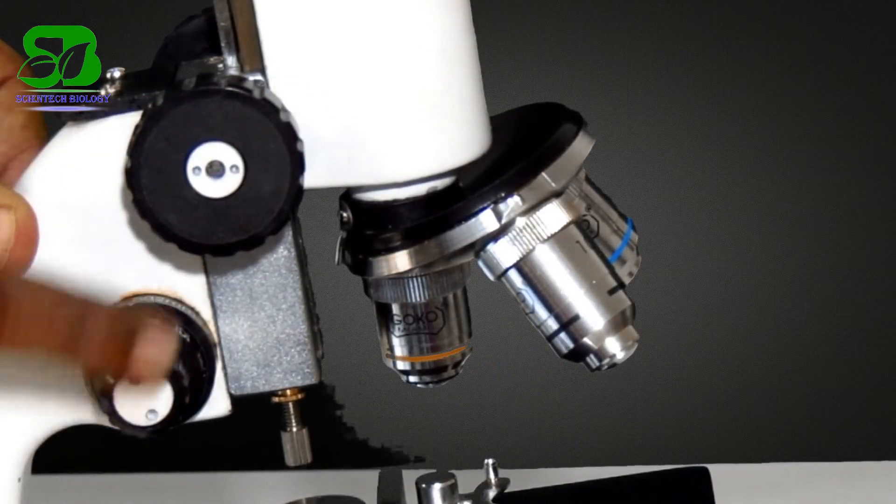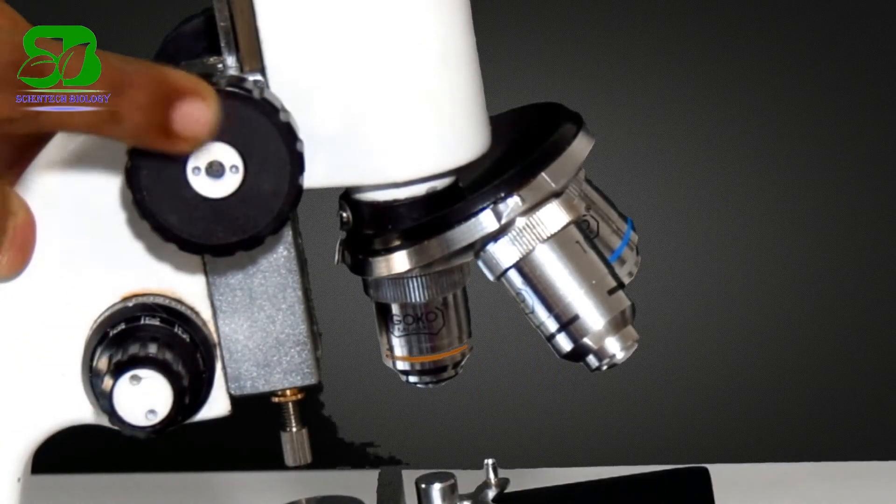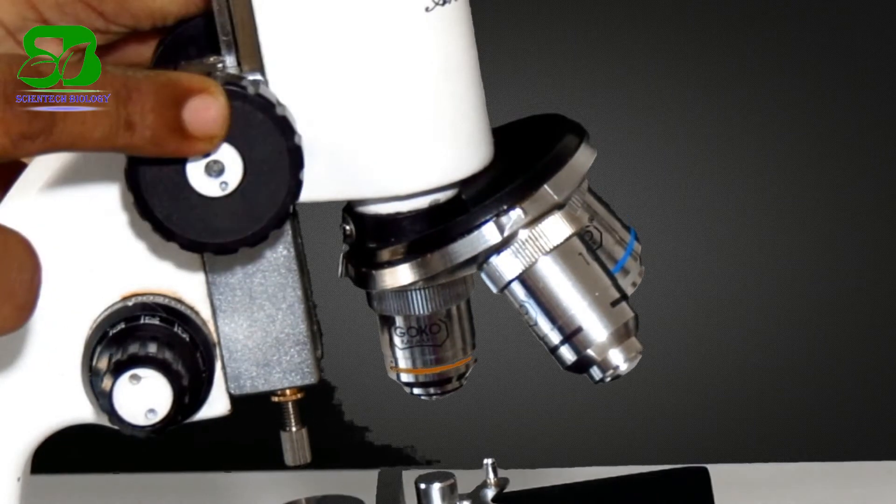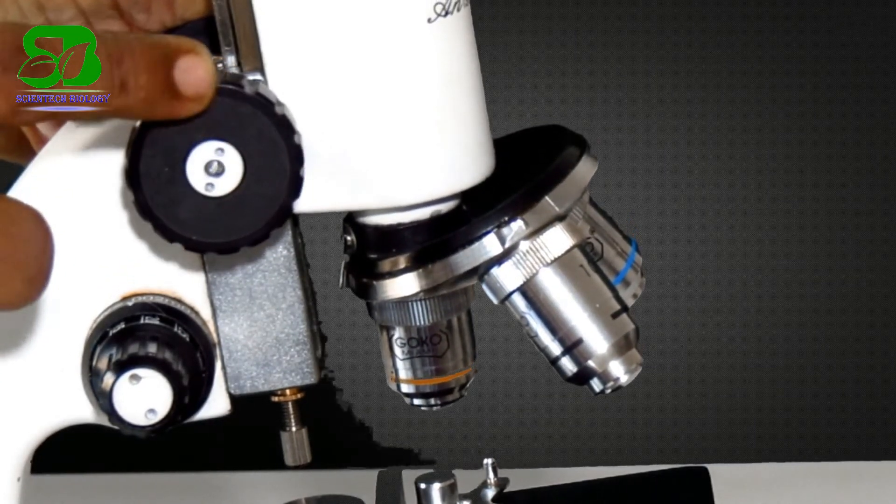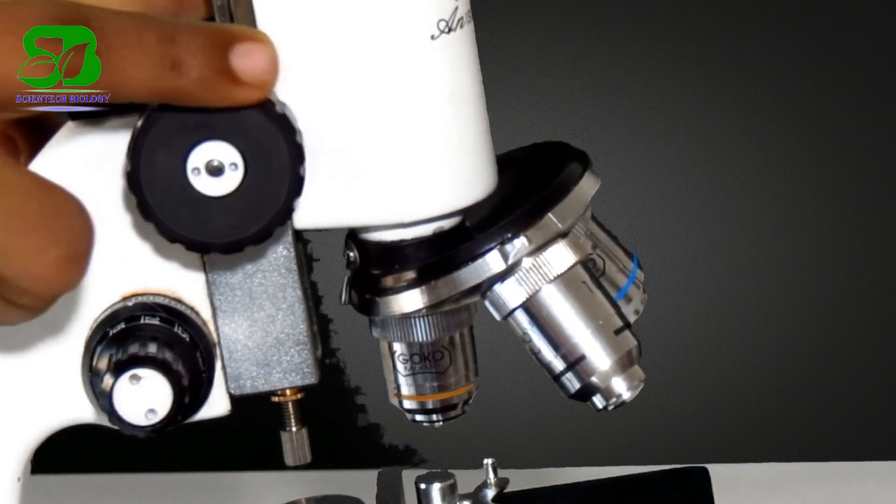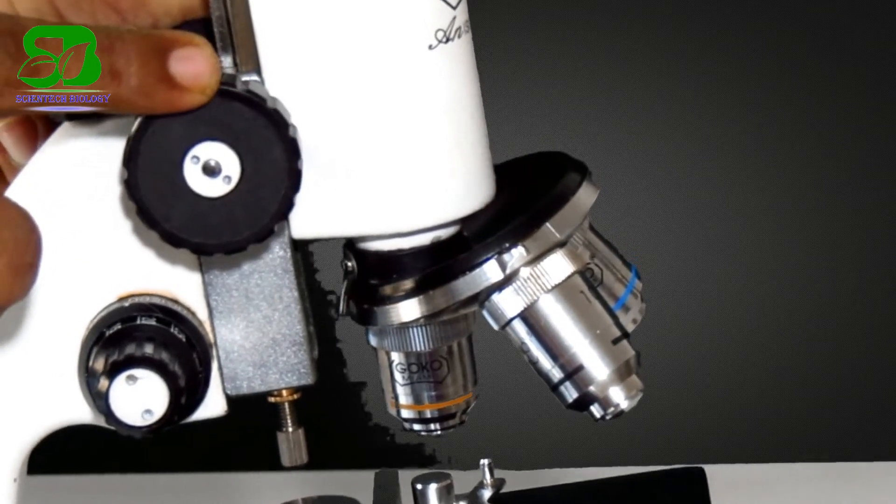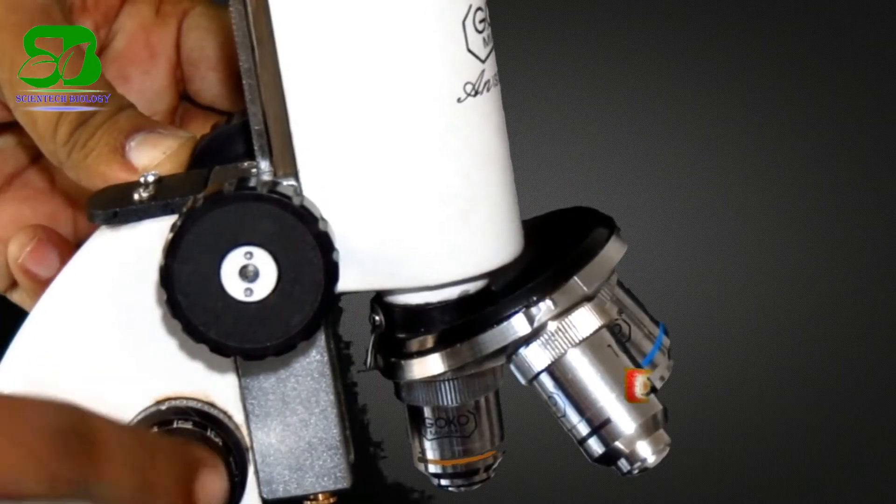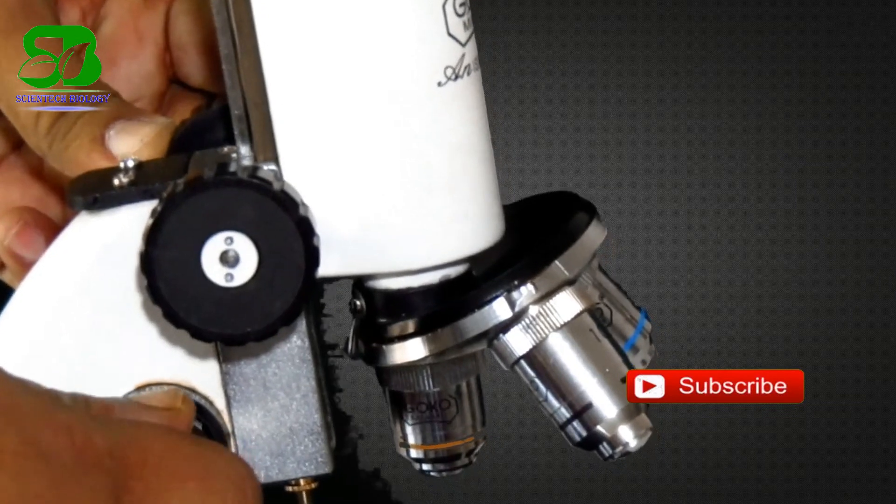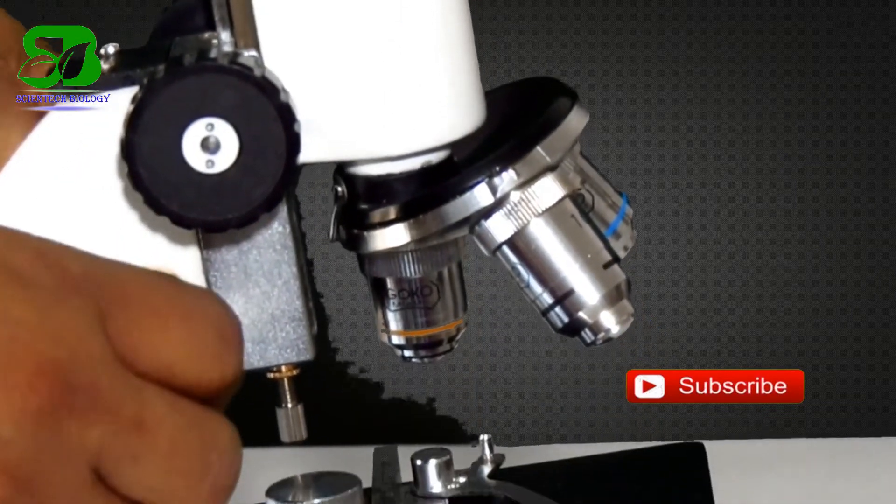Here at the arm you can see two adjustment knobs. The upper one is the coarse adjustment and the lower one is fine adjustment. The clockwise turn of the knob moves the body tube downward. This fine knob has similar operation and is used to focus on slides clearly.